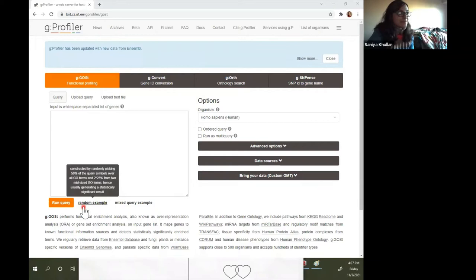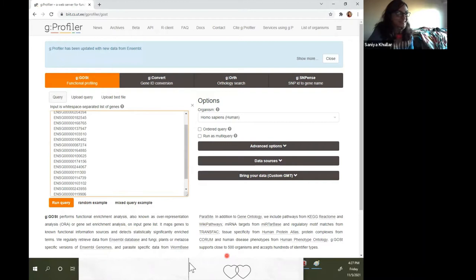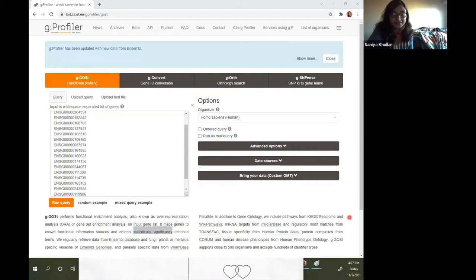G profiler also gives you a random example, constructed by randomly picking 50% of the query symbols over all GO terms. This is something that will give you some statistically significant results, because that's what we're looking for — statistically significant enrichment. These are Ensembl IDs in the example.